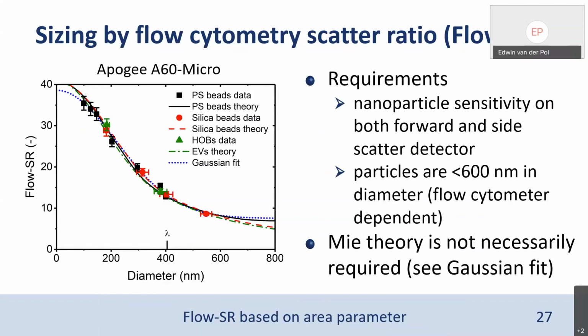Stephania asks, you're talking about your EVs and lipoproteins. Is the plasma from fasted or non-fasted? You see different amounts in fasted and non-fasted. Have you looked at that? Yeah, we have looked at that, and I did not put those data on the slide. The data I've shown today were partly from platelet concentrates and partly from a plasma sample.